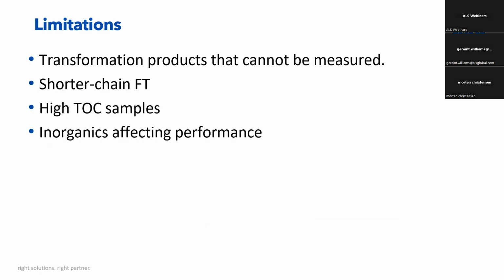There are limitations, as I mentioned at the very beginning of my presentation. There are a number of limitations that we do need to be aware of. And as I said, there's a variety of TOP assay methods, and I've seen some other techniques that we've been talking about as well, things like direct TOP assay and the enhanced total oxidizable precursor assay. So there are various different methods available, and there's no standardized approach at this moment in time.